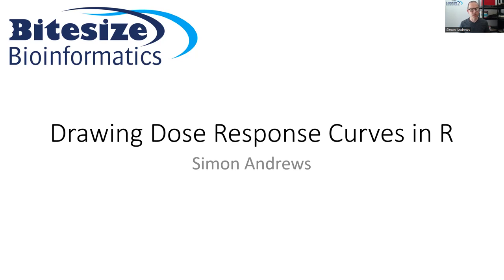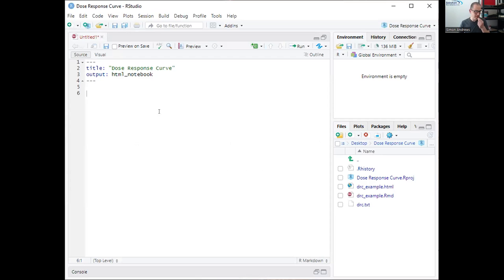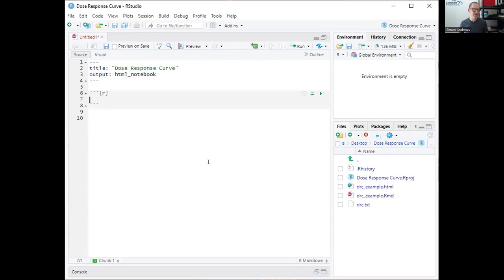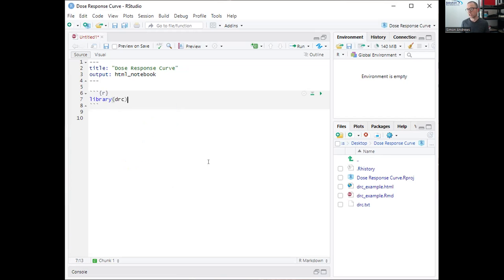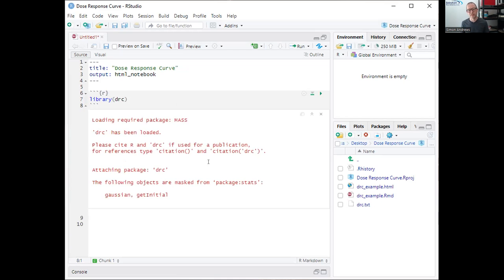I'm going to do this as a walkthrough inside RStudio. I've got a blank document here and we're going to do this all the way from first principles. The package that's going to do the heavy lifting for the curve fitting itself is the DRC package — the dose-response curve package — which actually calculates the curves, has functions for building those, comparing parameter estimates from them, and predicting from the model that it builds.